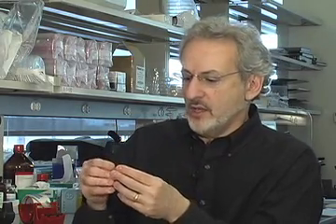It's this ability to combine all of these different features in this little flexible device that we see in the whole lung that allows us to predict results that we actually show we can confirm in animal studies. We're already using human cells in these devices. Hopefully someday we could use a patient's own cells to even develop personalized therapies.